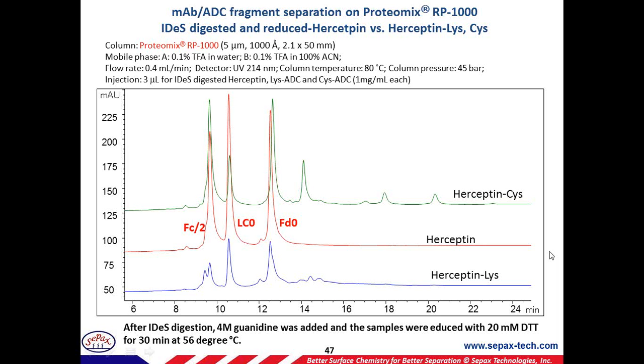A lot of these drug conjugates have secondary interaction with traditional resin surface due to the hydrophobic nature. We also talked a little bit about the additives to improve the separation. It really depends on individual ADCs. You can try those organics, chaotropic agents, and arginine, all these additives to improve the resolution. A smaller pore size than C SEC, we found very beneficial in our free drug analysis.